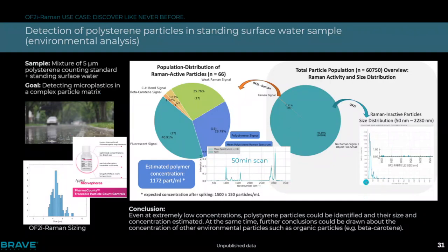So most of the particles are in this very small size regime. We used our normal characterization regime. We saw, of course, some very low concentrated bigger particles, but most of the particles are really very, very small. So it really goes exponentially with size up.